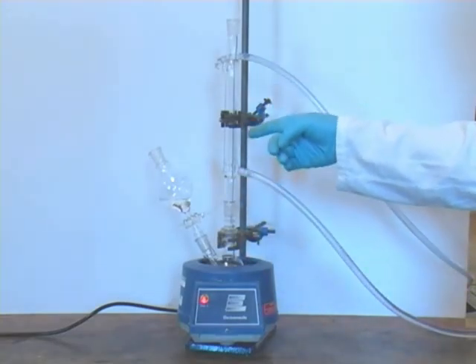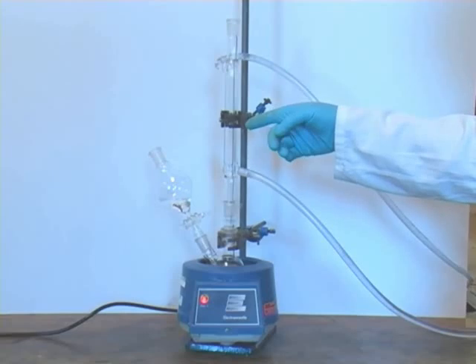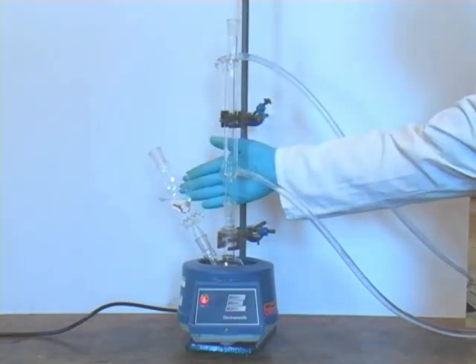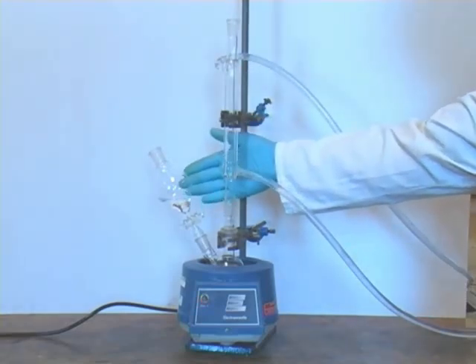Above our reaction flask, we have a condenser in an upright position. In the other neck of the flask, we have a dropping funnel which contains the solution of the other reagent we need to add to the reaction mixture.